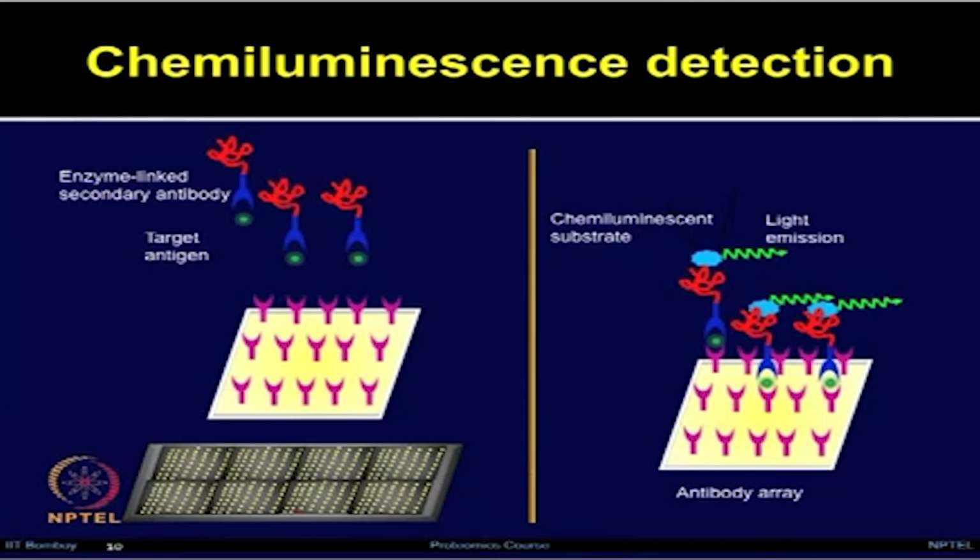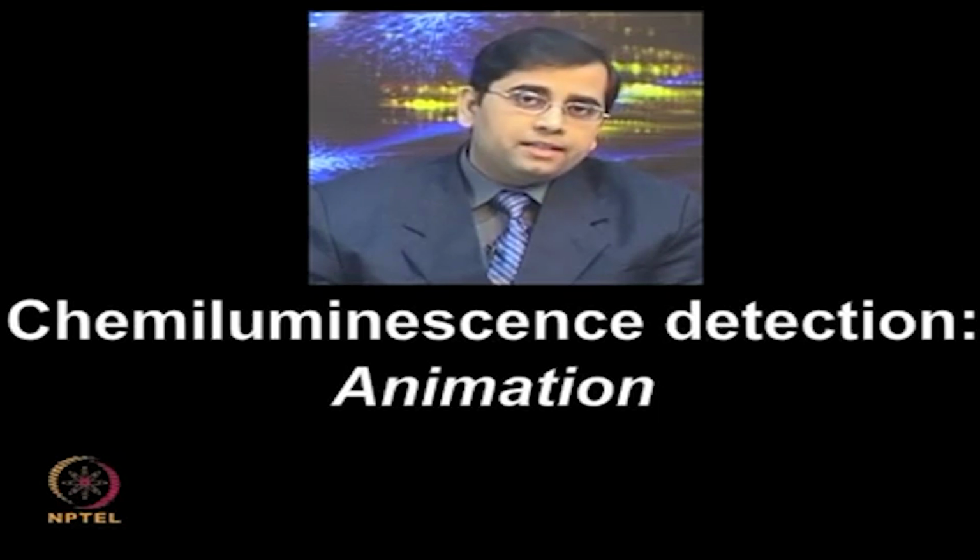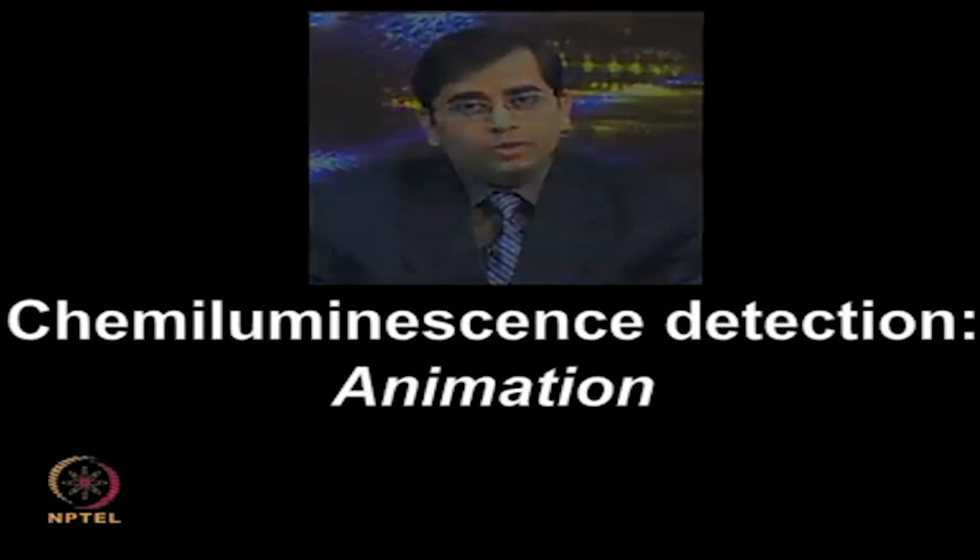Now, the excess antibody which is unbound can be washed off and chemiluminescent substrate is added which reacts with the enzyme and emits the light signal. Let us watch this animation on chemiluminescence detection system to understand its concepts and mechanism.